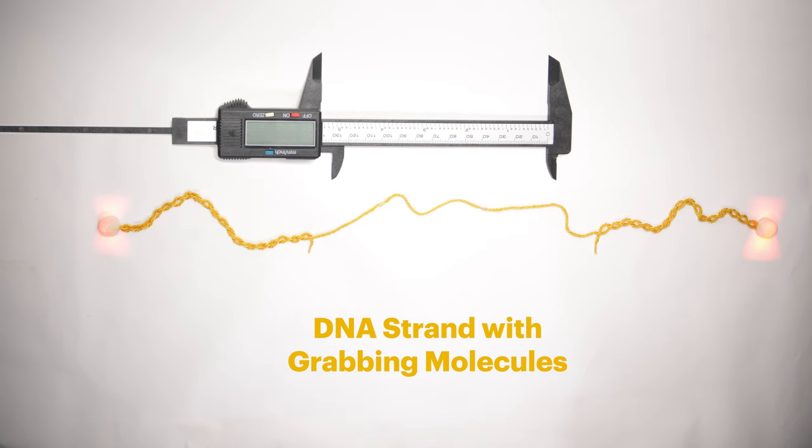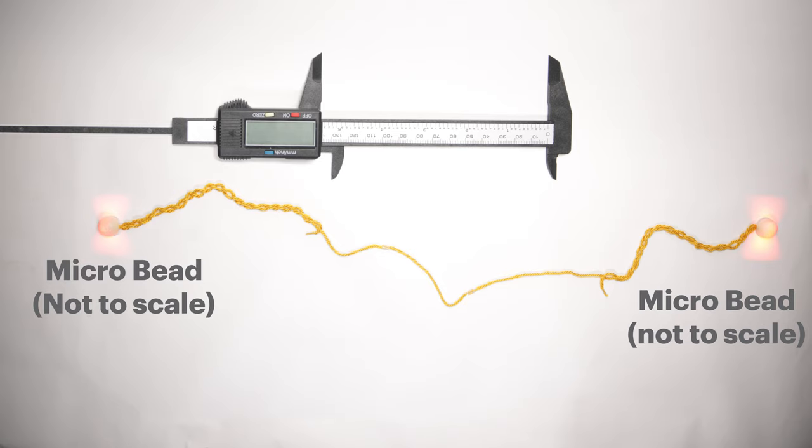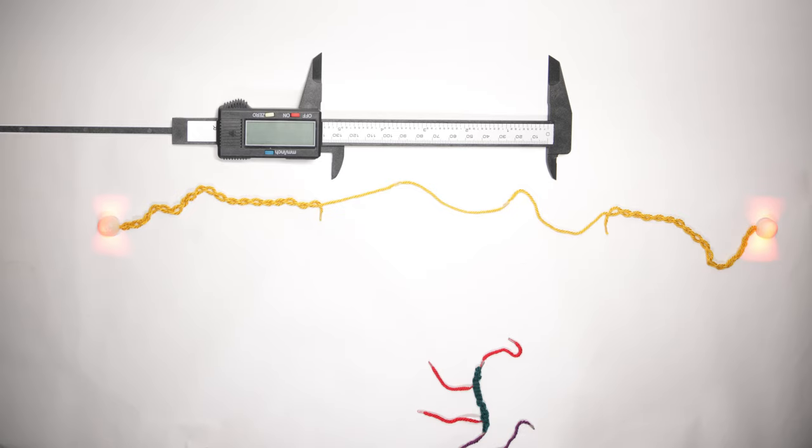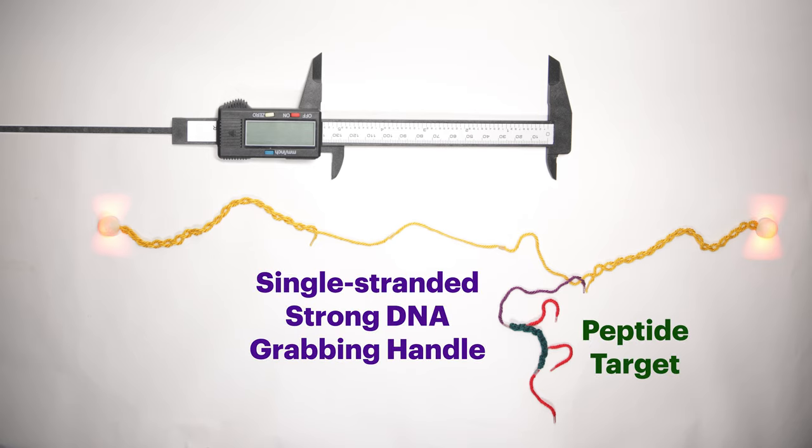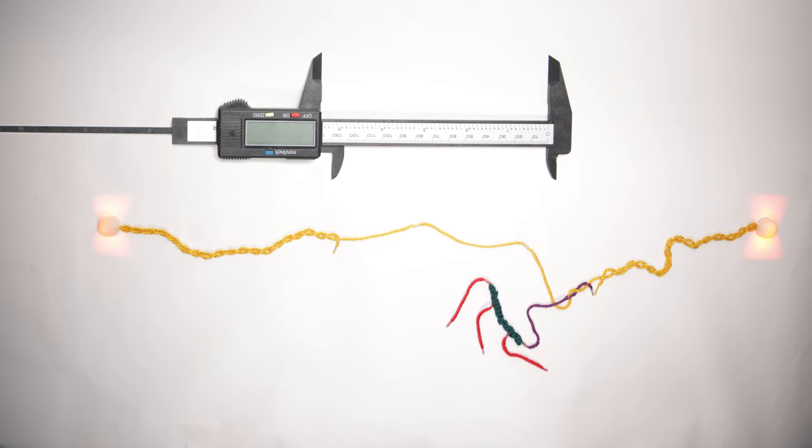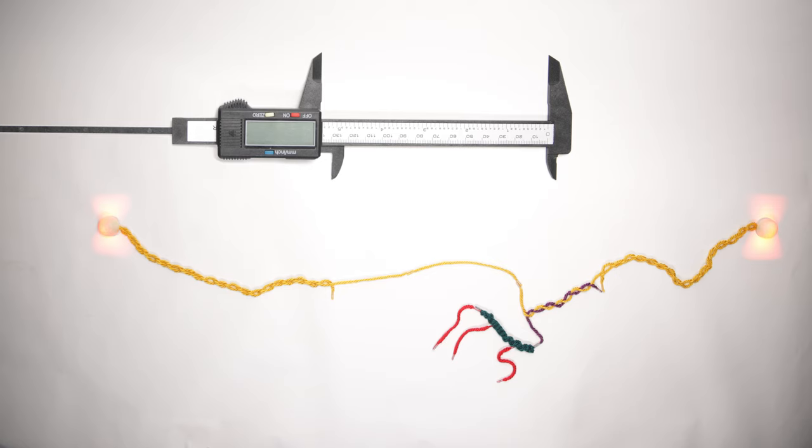The DNA caliper is illustrated here by the yellow string. It is attached to two microbeads. To map the shape of a protein of interest illustrated by the green peptide, we attach a single-stranded strong DNA grabbing handle shown in purple to one end of the peptide that binds with one side of the DNA caliper.